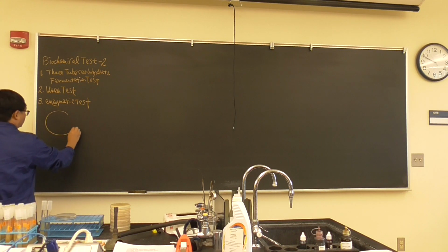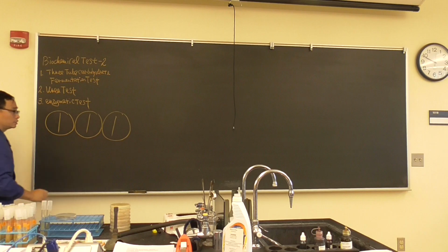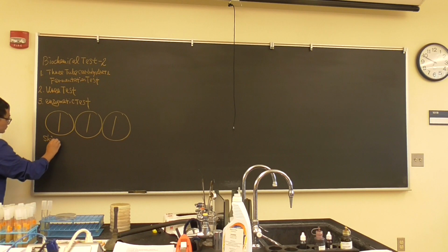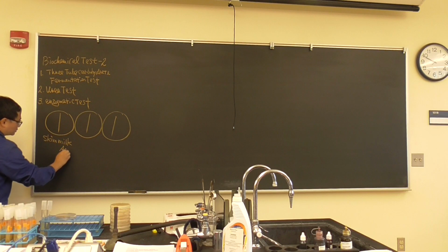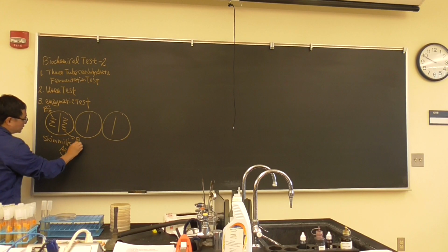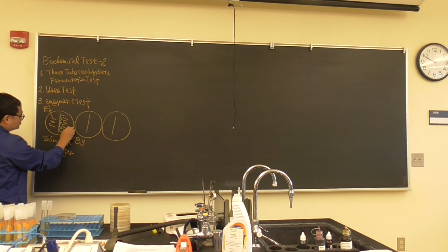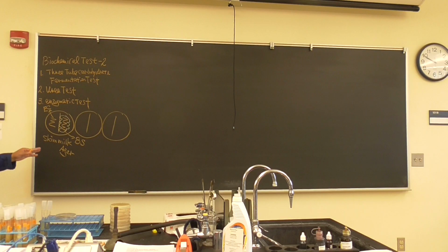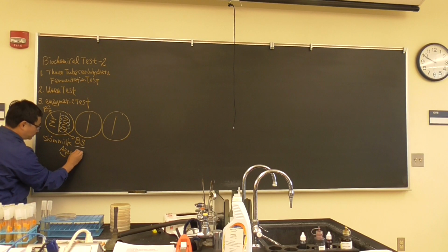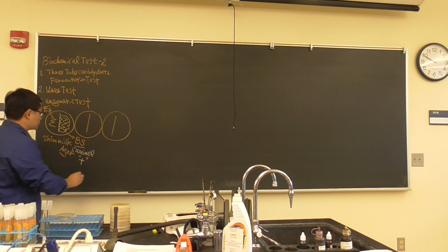So what we have is, if you remember, we have those 3 agar plates and we split them onto 2, which is skim milk agar. And on one side you inoculate E. coli. The other side you inoculate Bacillus subtilis, and you should see a very clear transparent zone, or a huge transparent zone surrounding the Bacillus subtilis. So Bacillus subtilis is caseinase testing positive.